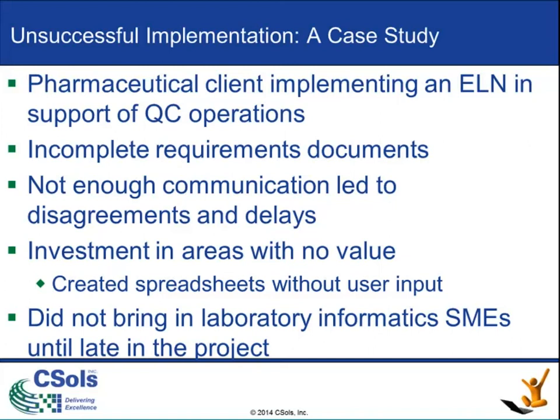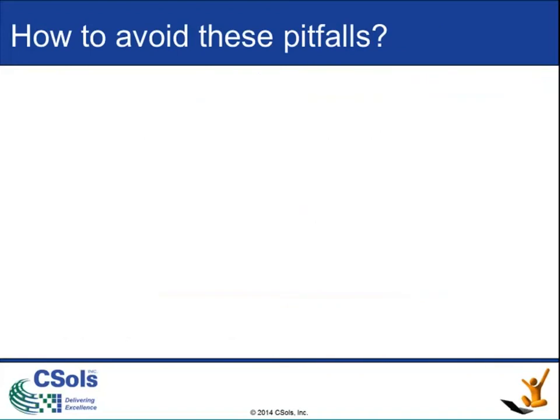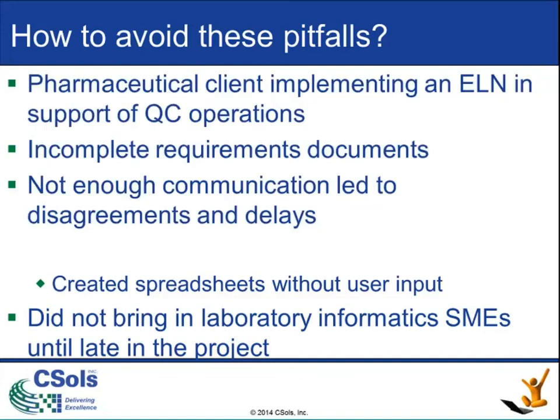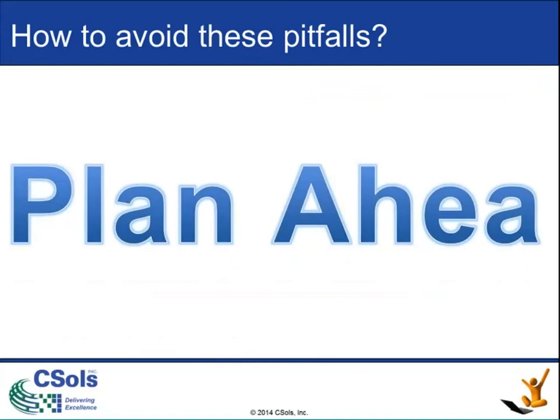Eventually, some lab informatics experts were brought in to assist with the validation effort, and the validation was completed and wrapped up. So the project was still behind schedule and over budget. So how do we avoid these pitfalls and have a successful E-Workbook implementation? Oh no. We plan ahead.